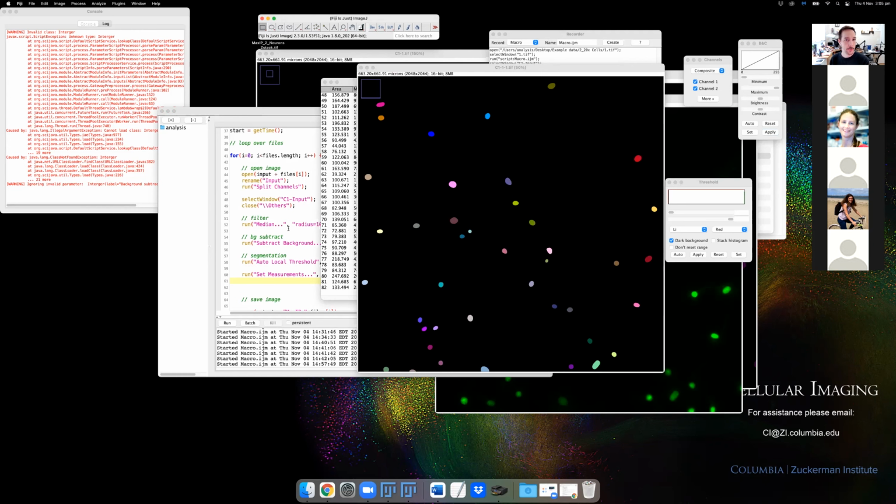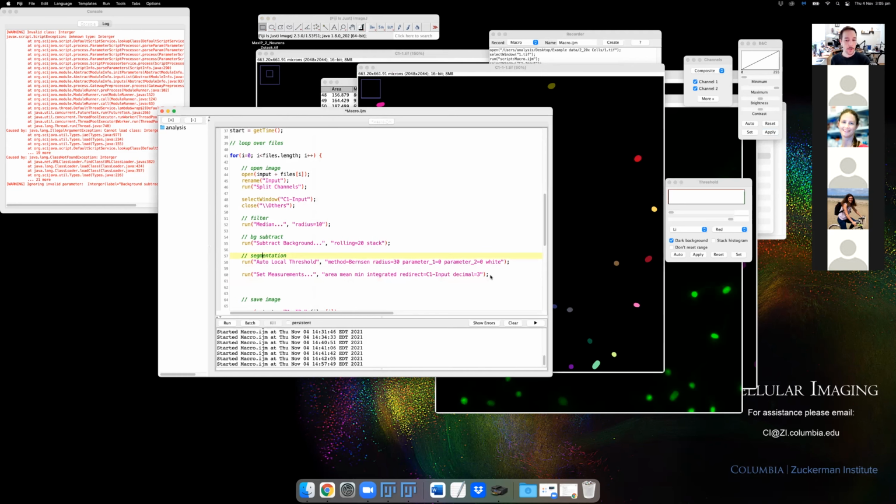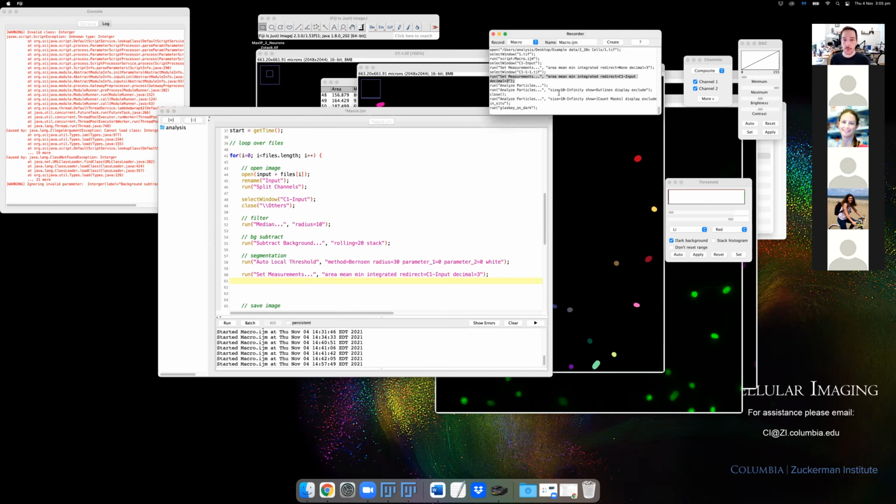Okay, so we've got a few things going now that we want to do. That last one I think is pretty close to what we want. So I'm just going to copy and paste that. And in fact, whenever you're doing this kind of analysis, I prefer things not to be a black box. So I always try to write things in a way that I'm getting either intermediate results or final results saved, as well as the tables and statistics, because that way it's very easy to audit what's going on. And you can share that data so people can see how you've performed the analysis, how it looks. So I'm going to put the lookup table. This is that change in color that we applied.